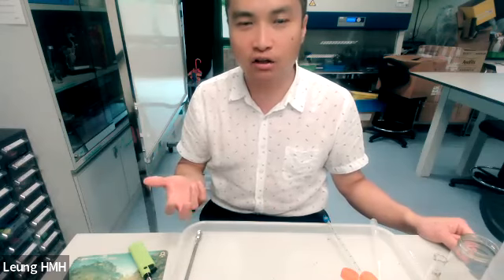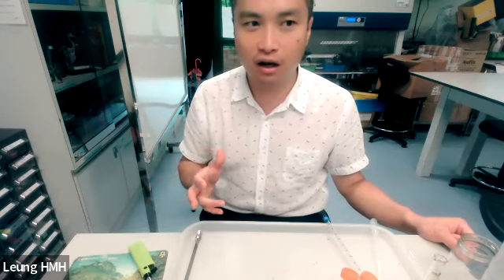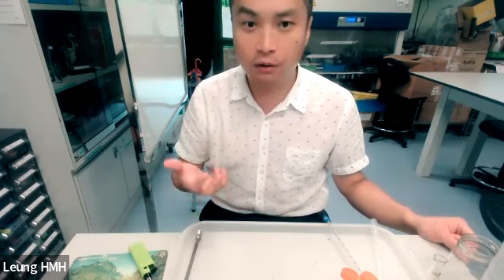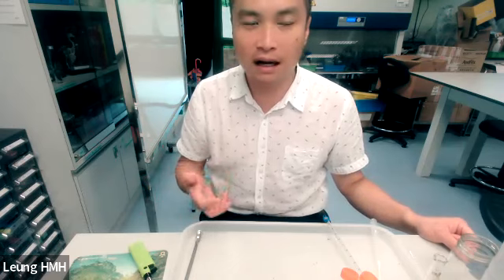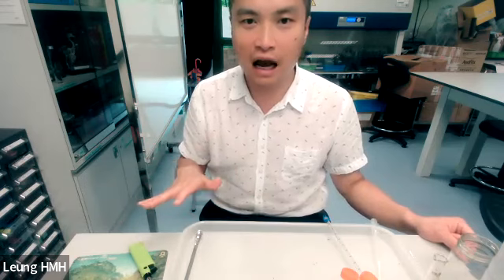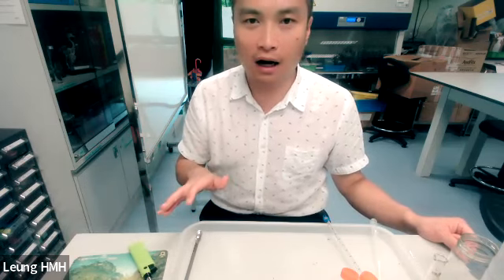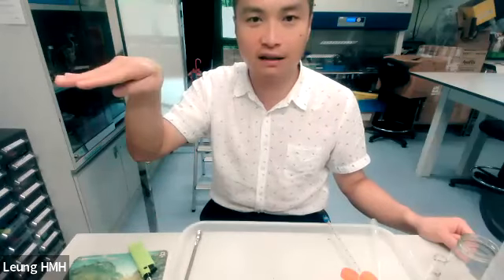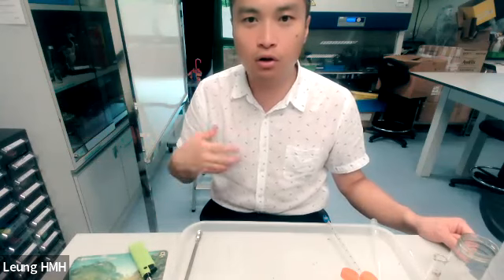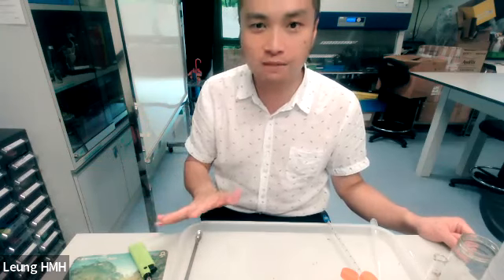The reaction may vary in different situations. So in lab scale we have a demonstration on this, but in commercial scale we need to control the whole process carefully so that we assure the quality meets the standard and can be used by car owners and in commercial use. Okay, that's the end of the first part of the experiment.